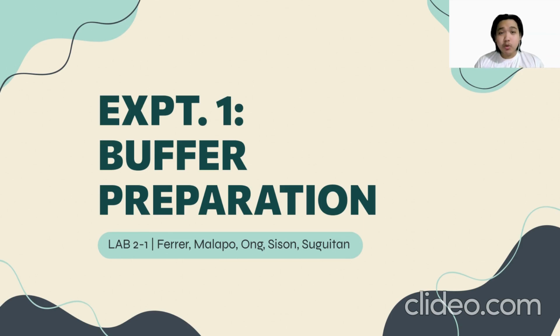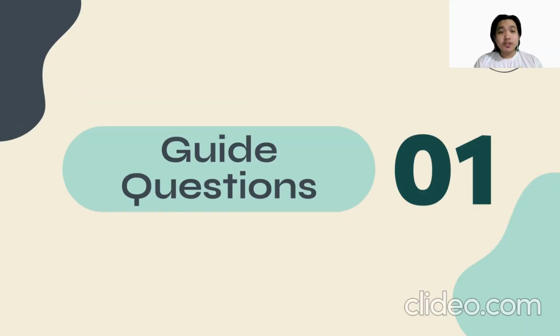Good morning. We are Group 1 and today we will be presenting our Experiment 1 buffer preparation. To start, let's first answer some guide questions.